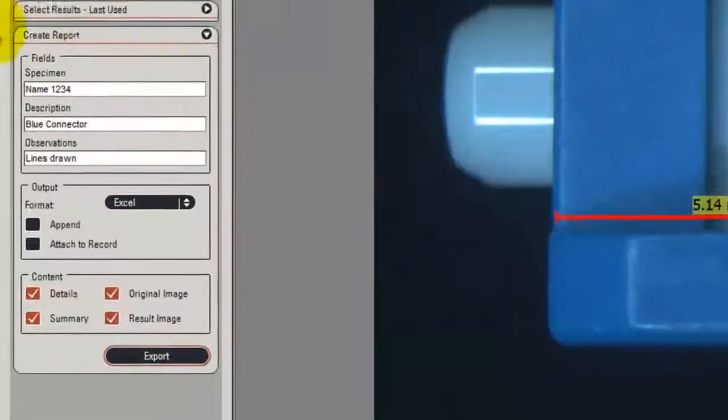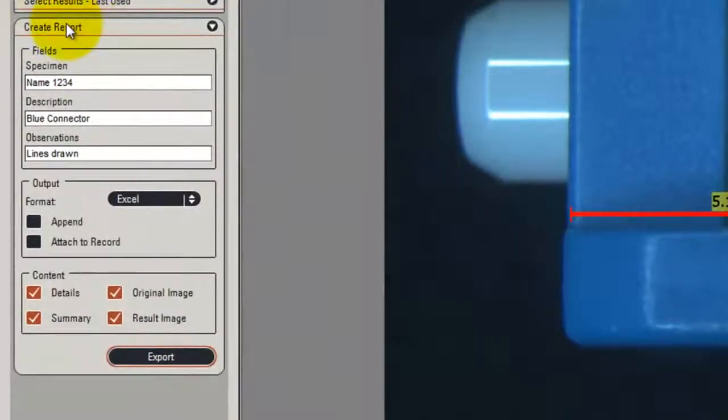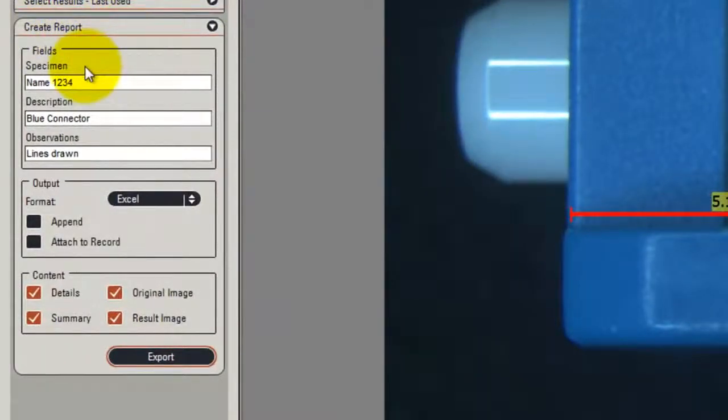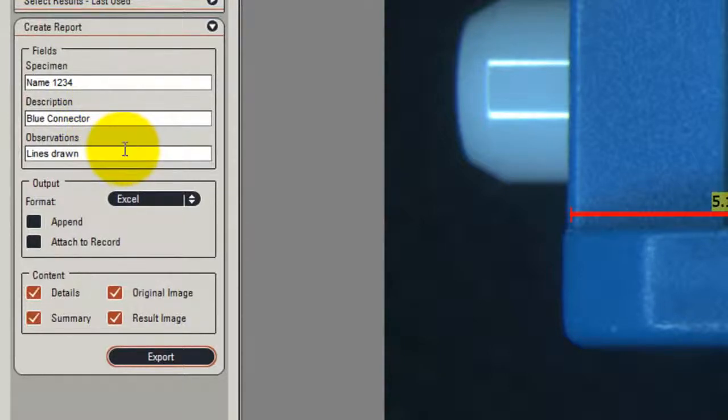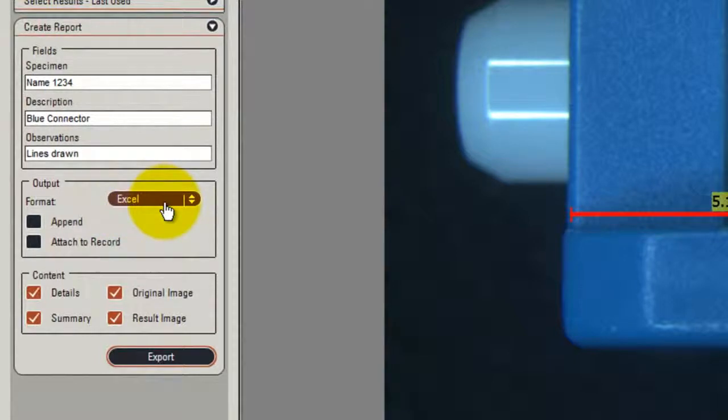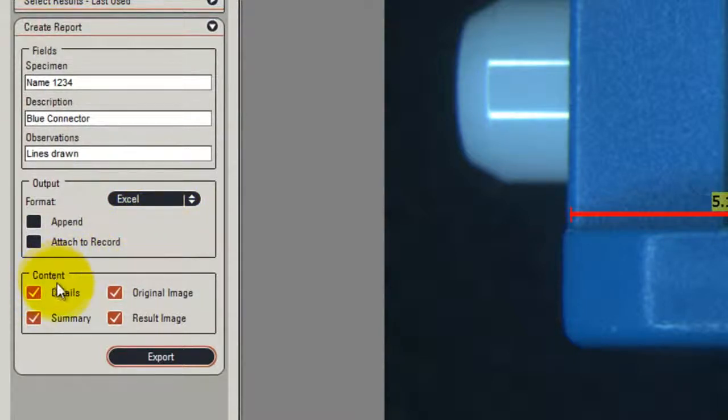In the Create Report panel, I've entered the specimen name, some descriptions and an observation about it. I also select that the output is going to Excel.